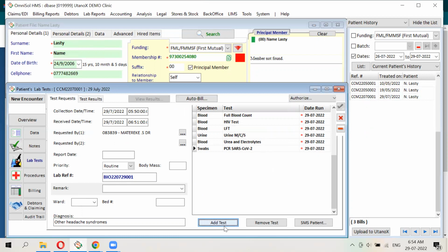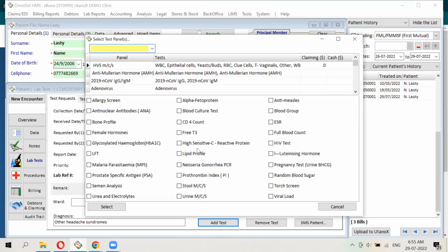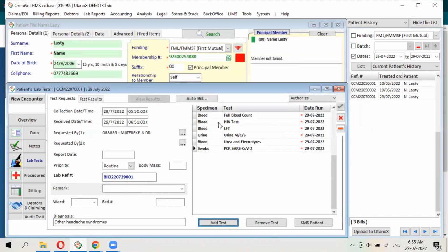Okay. Is there anything else you feel we can use for illustration right away? No, it's fine. It's fine. Okay. So let's go deeper next time.